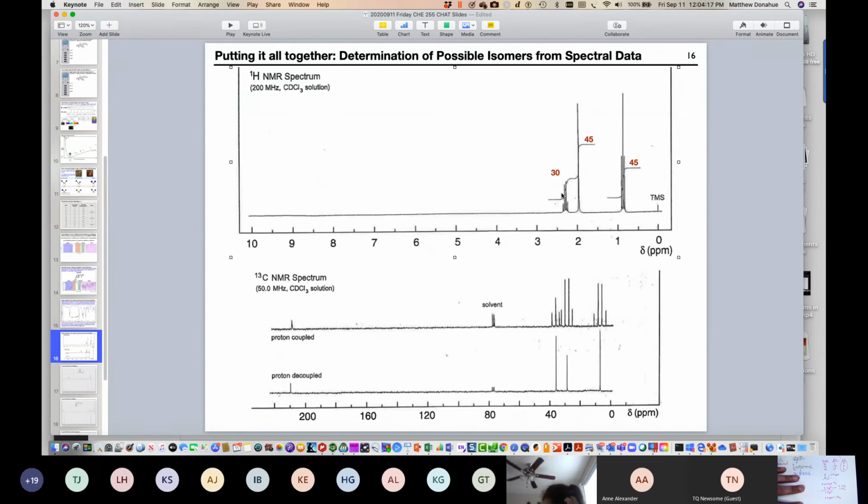Now look at the remaining peaks that belong to 45 and 45. What do you think this one where my mouse is pointing to? I'm going to renumber the carbons: 1, 2, 3, 4. Where my mouse is pointing, we've already assigned carbon 3 to 2.5. So now we have 2 methyl groups remaining. The peak at chemical shift of 2 belongs to which carbon atom, 1 or 4?